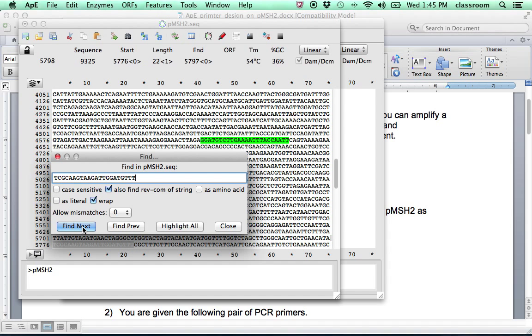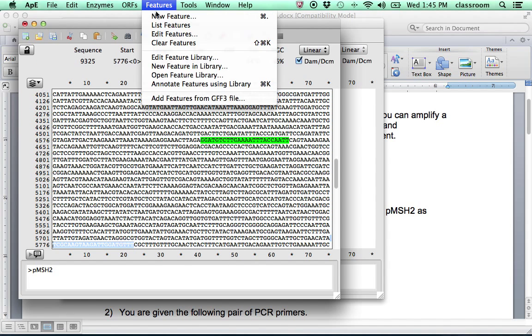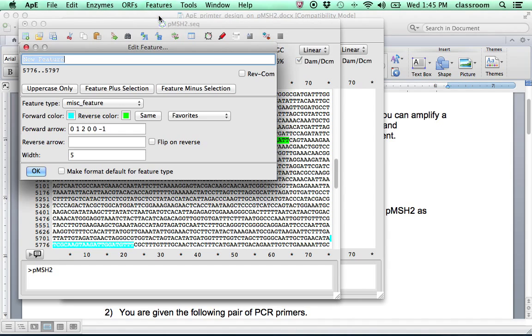So this is on the sense strand. So we go to Feature again, New Feature. This is primer beta. This one is on the same direction. So this is 500. So it's probably the same strand. So we click OK.